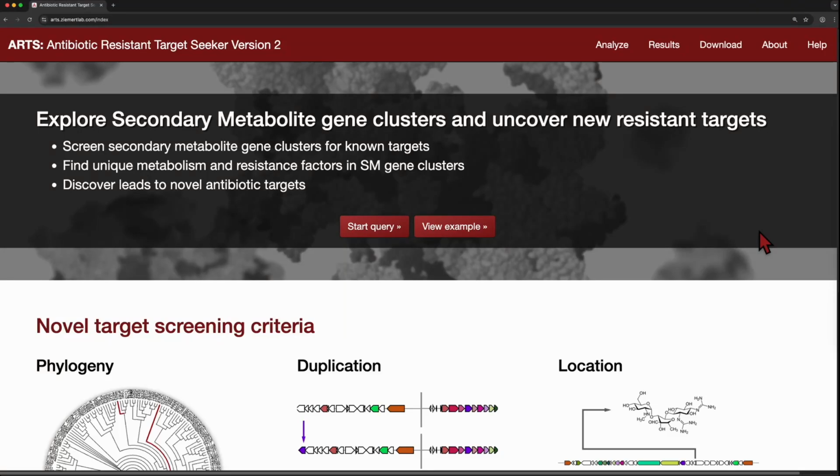Hello, and welcome to this tutorial where we'll show you how to use the Antibiotic Resistant Target Seeker, or ARTS, to screen for potential resistance genes in bacterial genomes. This video is divided into two main parts. First, we'll give you a brief introduction to how ARTS works. Then we'll upload a set of Salinispora genomes and guide you through both the single genome and multi-genome views. As an example, we'll focus on the Salinosporamide biosynthetic gene cluster and its associated resistance gene.